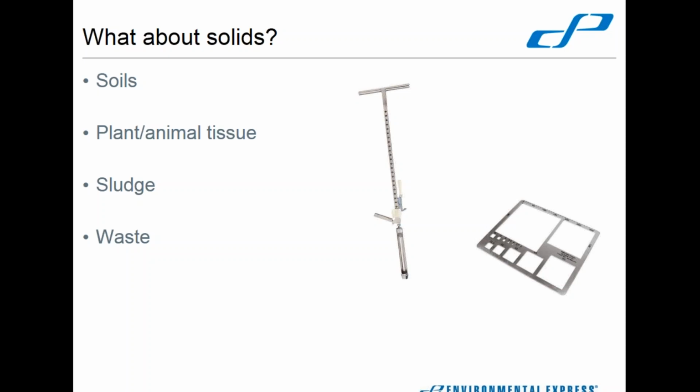There is another soil sampling program coming out called incremental sampling, and I believe that's going to start being used some in the Superfund sites when they start collecting their soil analyses. And so instead of the smaller and smaller volumes that lots of labs and analyses are going towards, it's going to actually start asking for larger amounts being used. Instead of a gram, maybe up to 5 grams or 10 grams of soil being used.